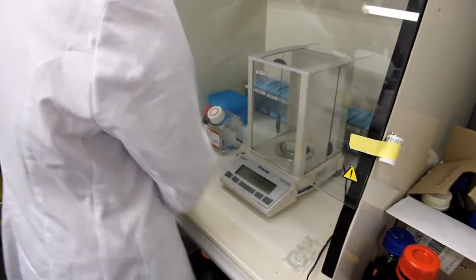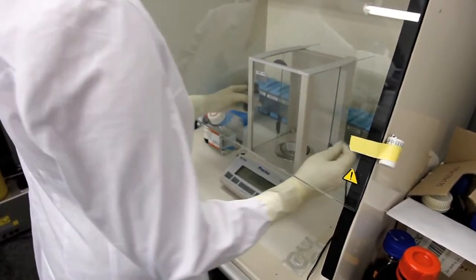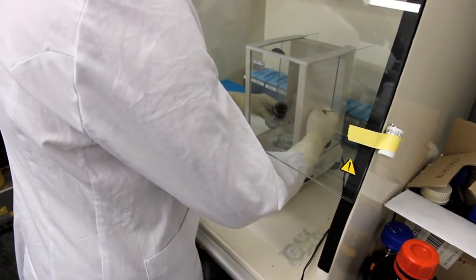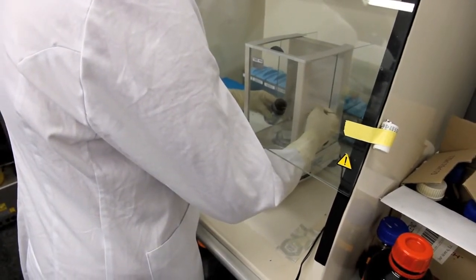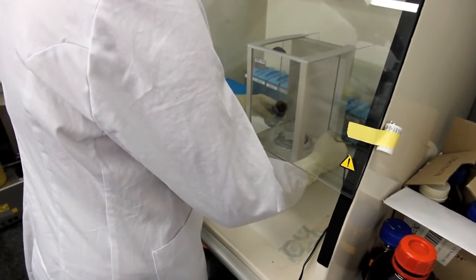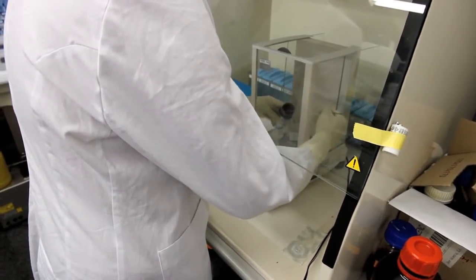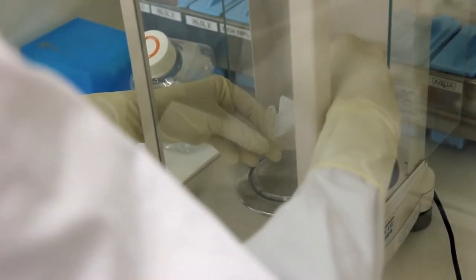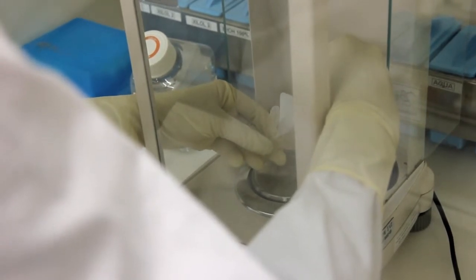Proceed by weighing enough busulfan for the preparation of a stock of 4 mg per ml. Consider the number of mice to be treated and assume that the approximate volume to be injected per mouse will be around 300 µl at a dose of 40 mg per kg. The dose required to cause germ cell depletion must be optimized for each mouse strain and can range from 40 to 60 mg per kg.